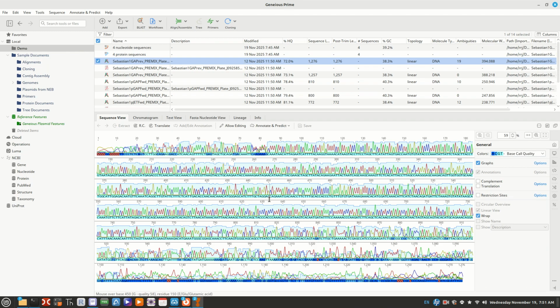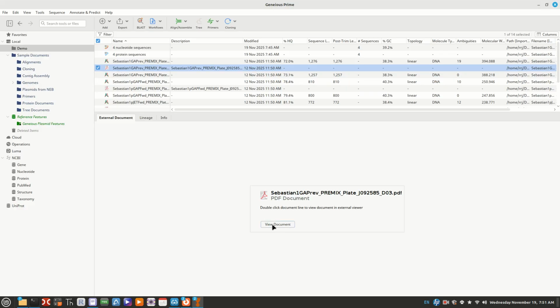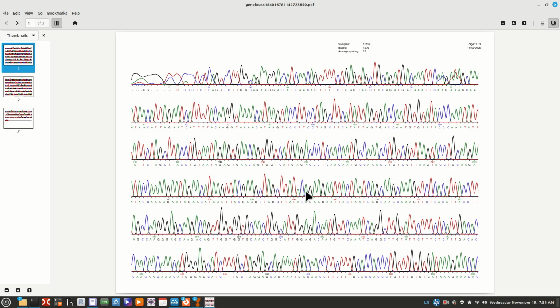Alright, so I wanted to show you this and how to load your sequences. Let's see, is there anything else we need to look at here? And yes, I am using, this is much clearer. It gives you the actual printout. We can see up close. I should have gone to this instead of the viewer. This is actually the printout for this.